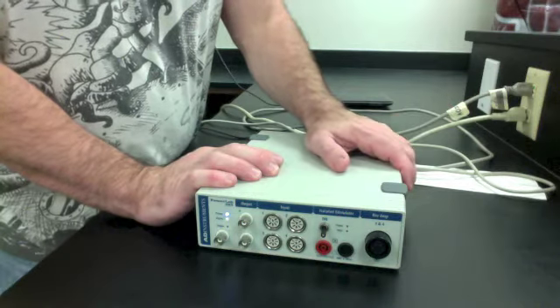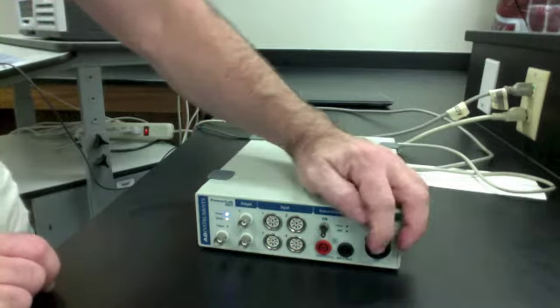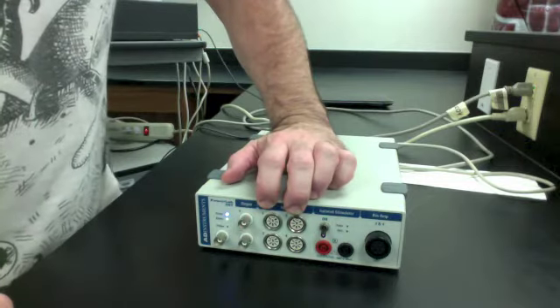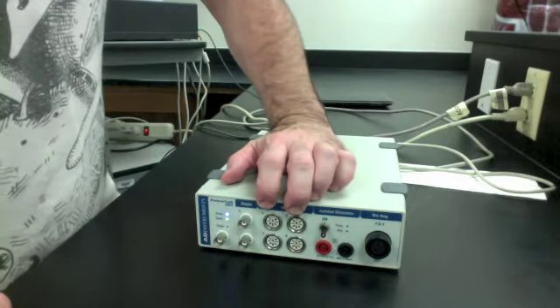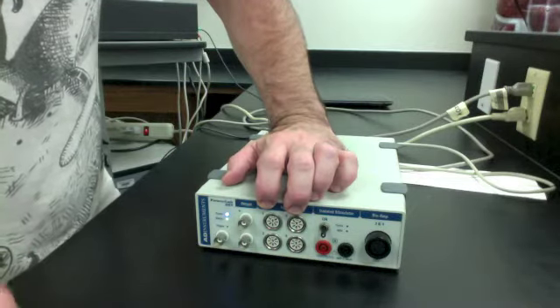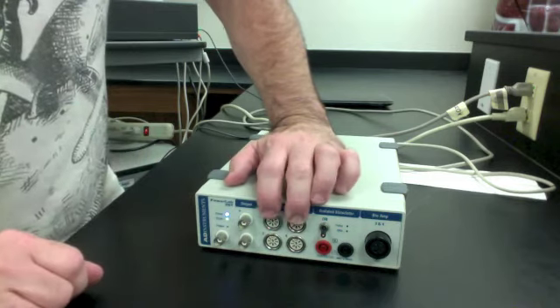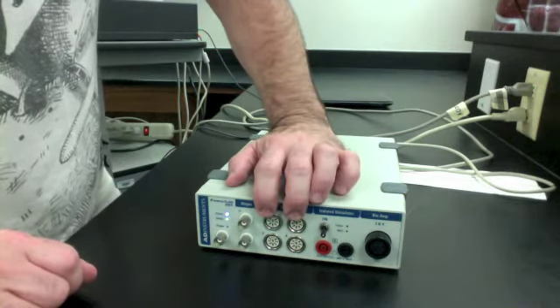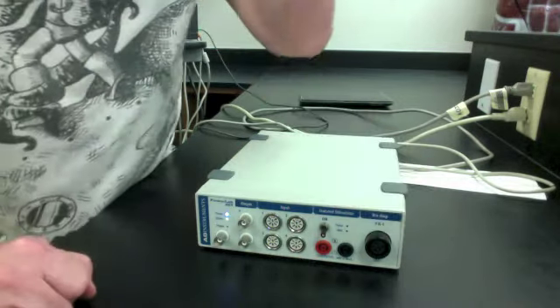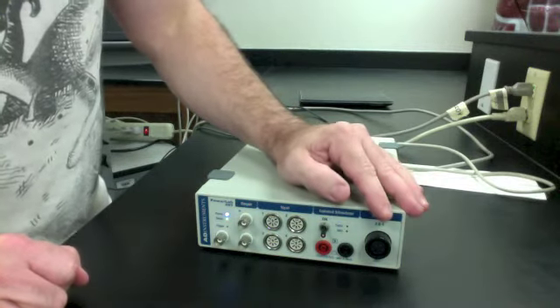It'll be on, the computer will be on, but just to give you an idea of a few things that are here, we have various inputs, right? So these are inputs you can use that you can put a wide variety of things that might measure amplitude of an action potential. They might measure force transduction. You can get various devices that measure force maybe and convert that into electrical signal. These are meant to be used with non-humans, right? The one on this side can also be used to measure things, but it's shielded in particular ways so that it's safe for humans to use.